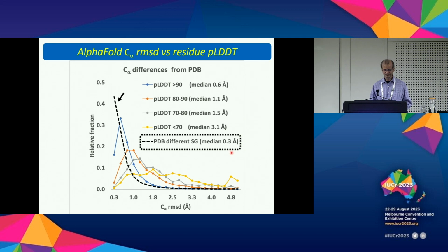And yeah, I see some nodding, like that's what you expect, right? So half of them are better than 0.3 angstroms. That's kind of the end of my chart here. So these are very good. And of course, there are some that are farther off, and that's because there are some domain movements in these cases too, right? So it's not perfect or anything.